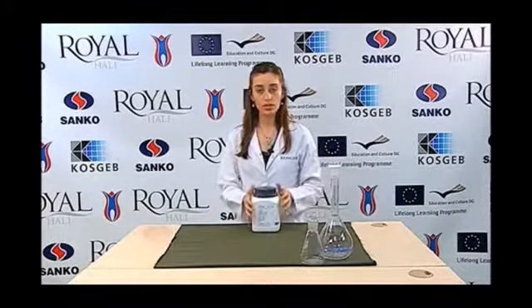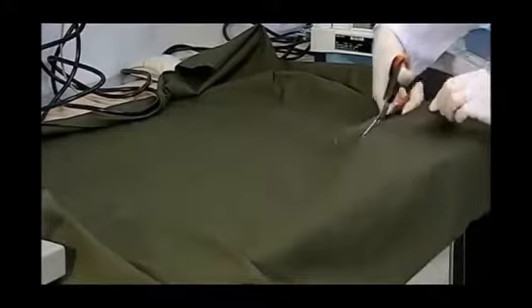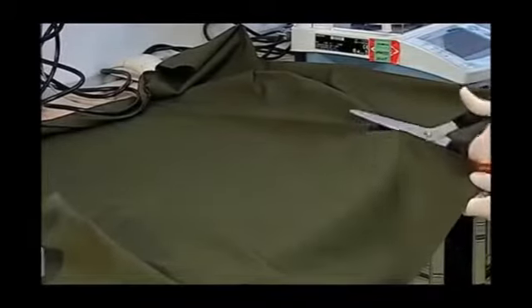During the sample preparation process of the pH test, we first lay our fabric on a flat surface. Then we cut pieces from different parts of the fabric. These parts must be 3 units, and we must make sure that the parts are not too small, for example, less than 2 grams.